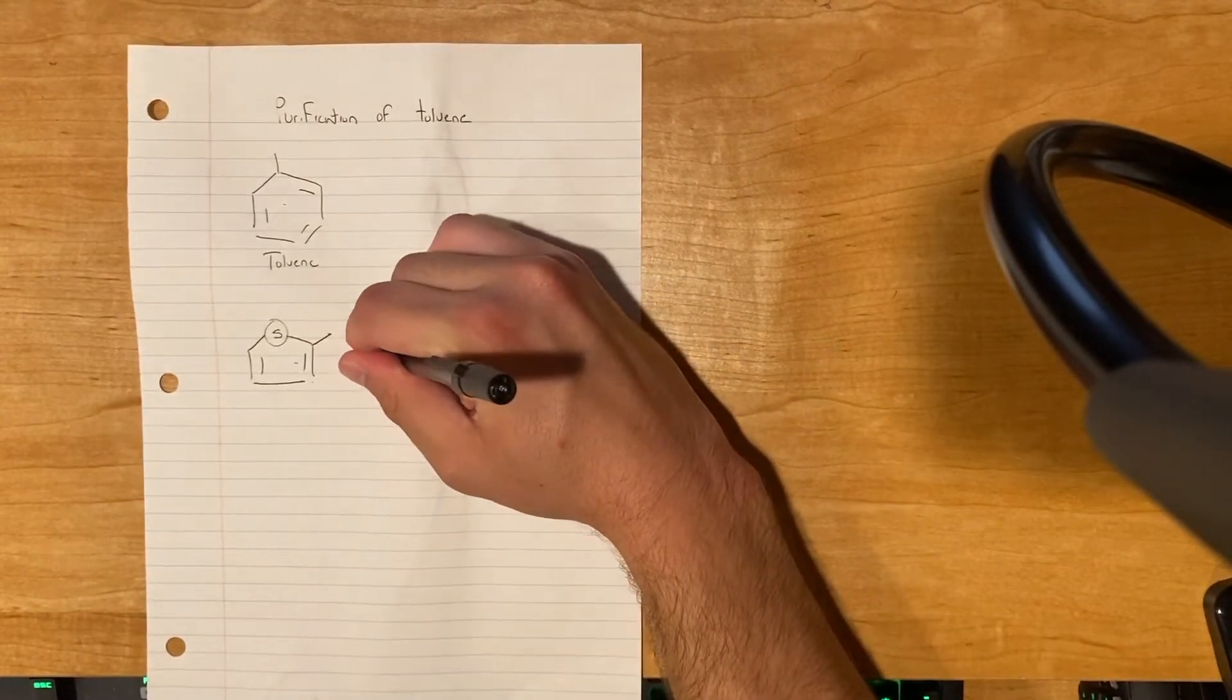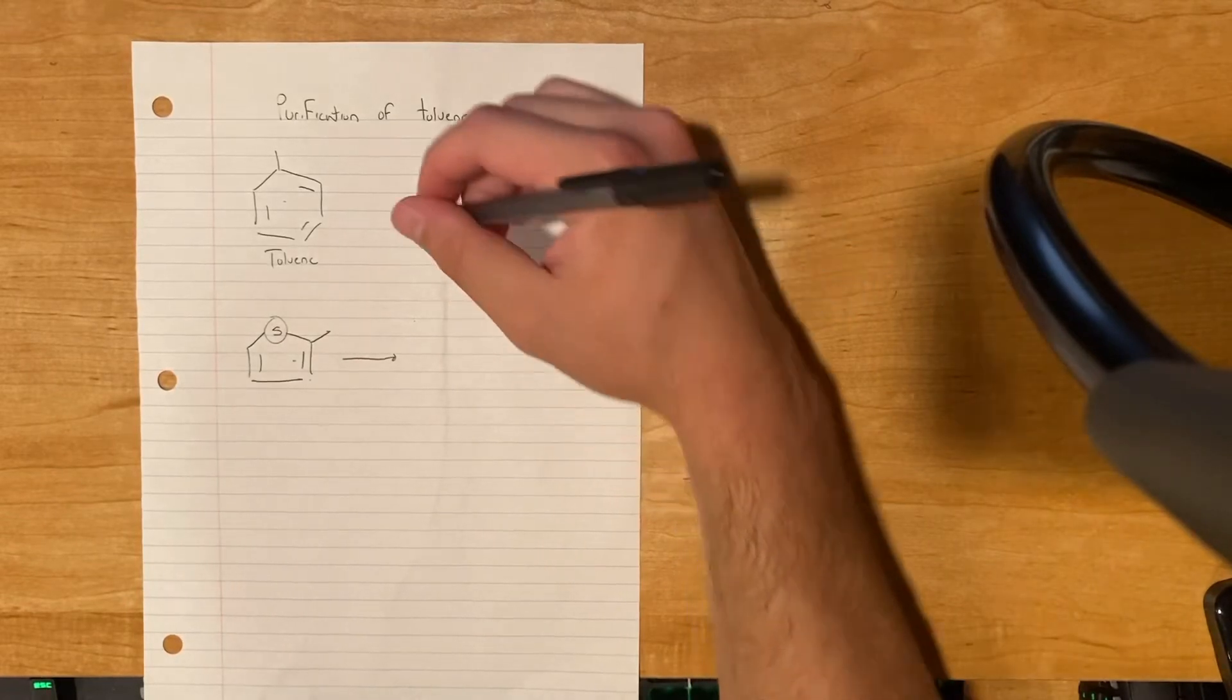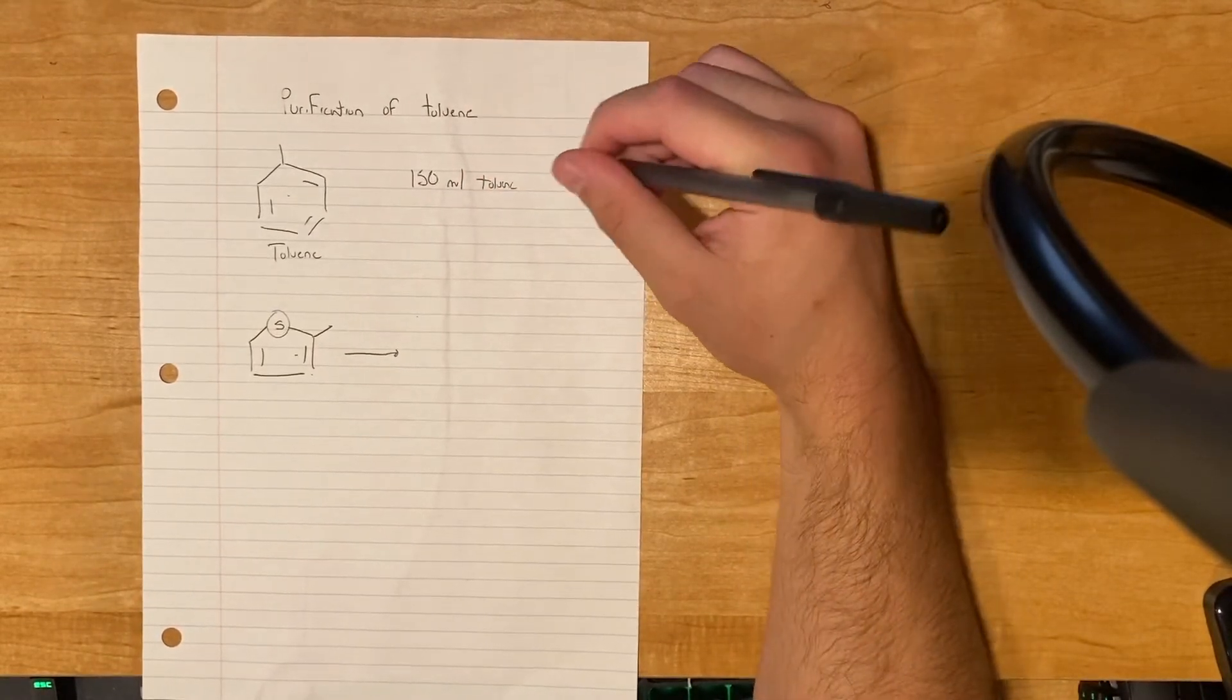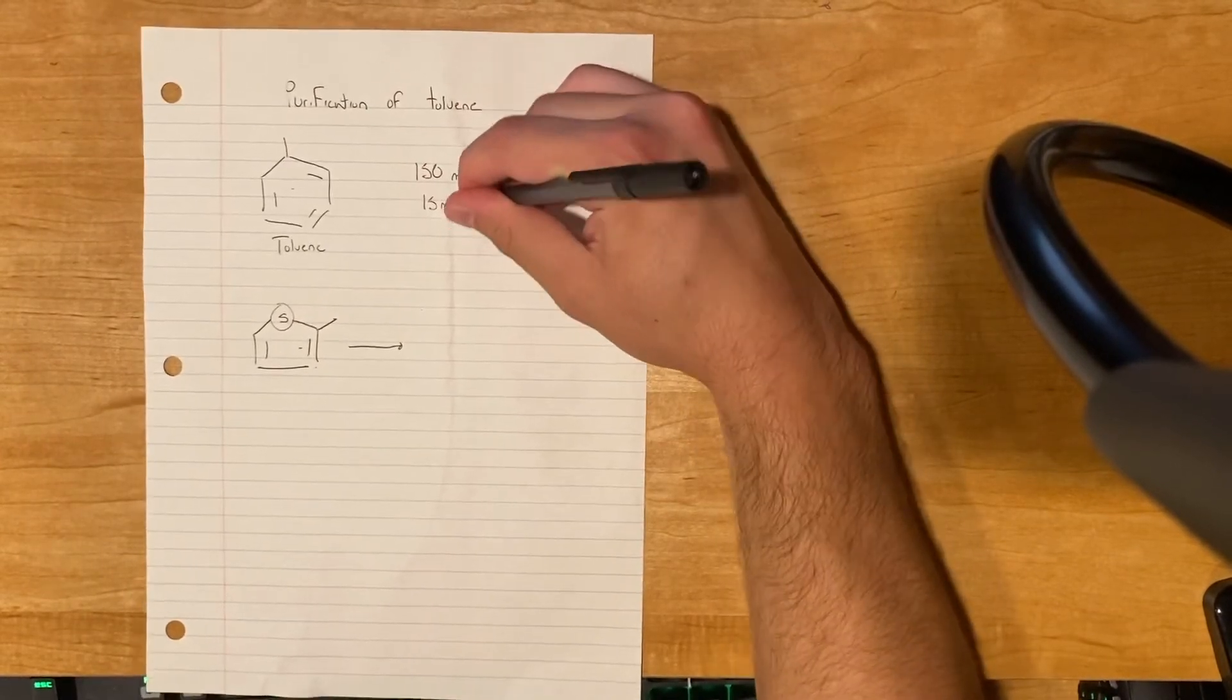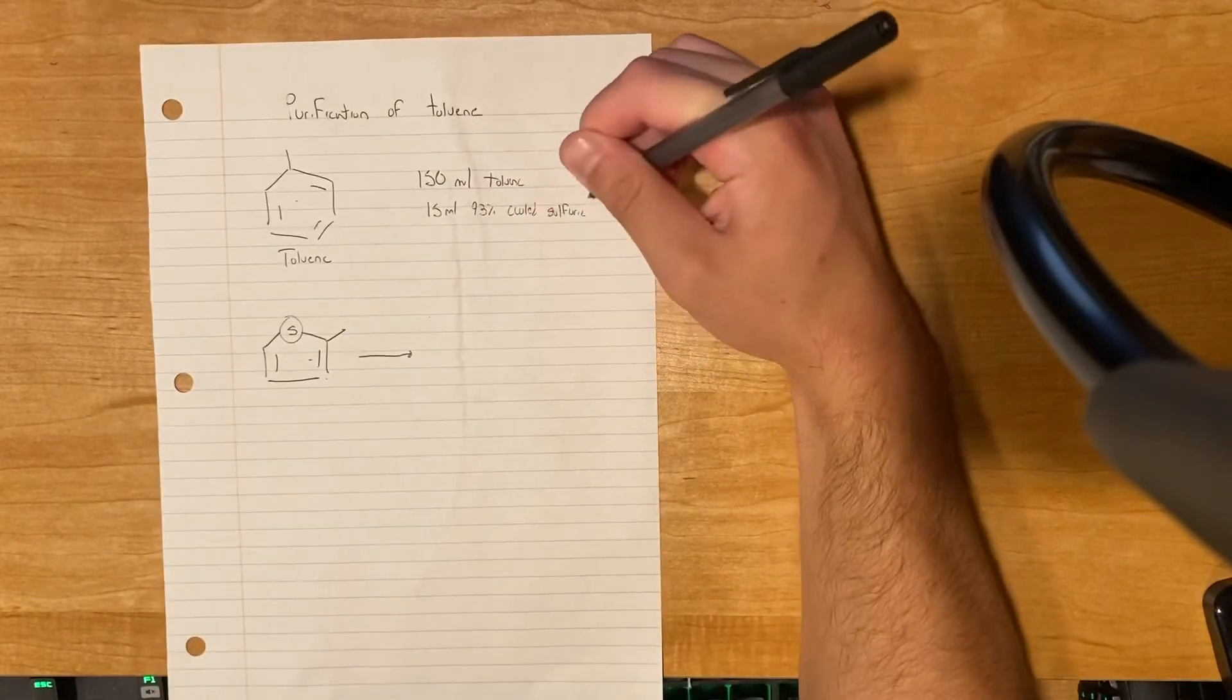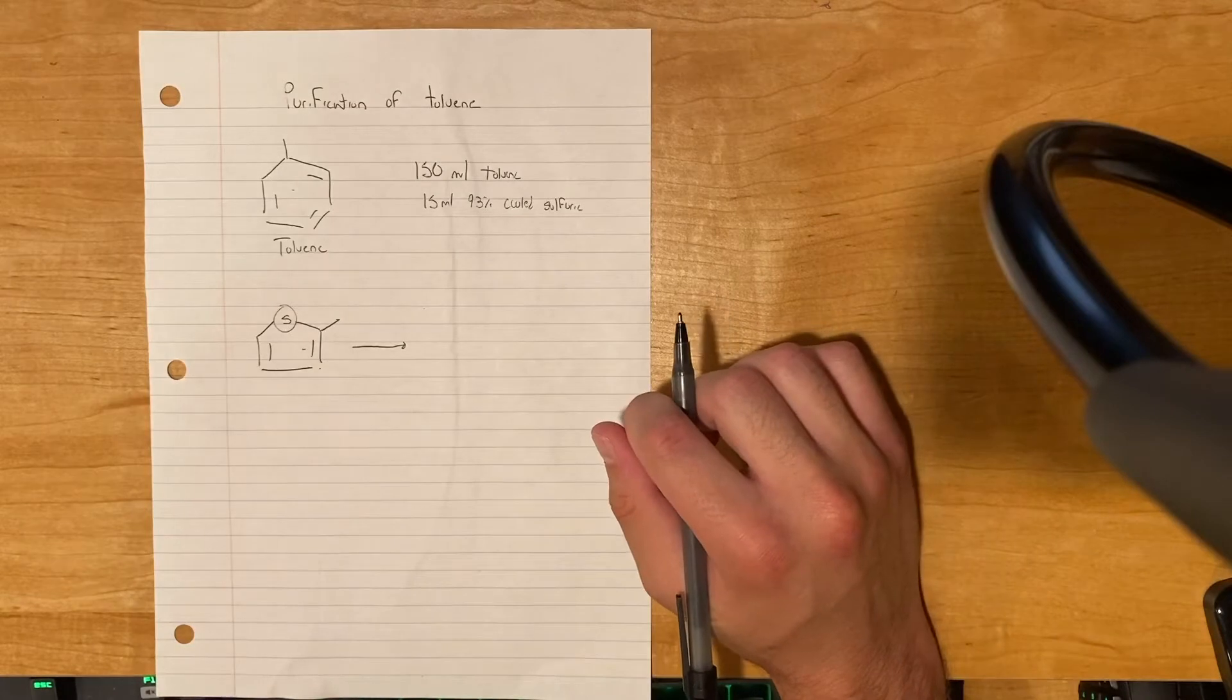So to do this, we add a 10% by volume solution of cooled 93% sulfuric acid. So let's say we have 150 milliliters of toluene that we want to purify. That means we have to use 15 milliliters of 93% cooled sulfuric acid. It has to be cooled or it might cause the toluene to boil and release toluene vapors into the room, which would not be good.